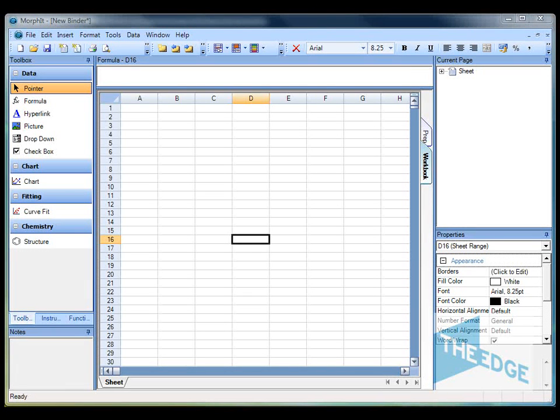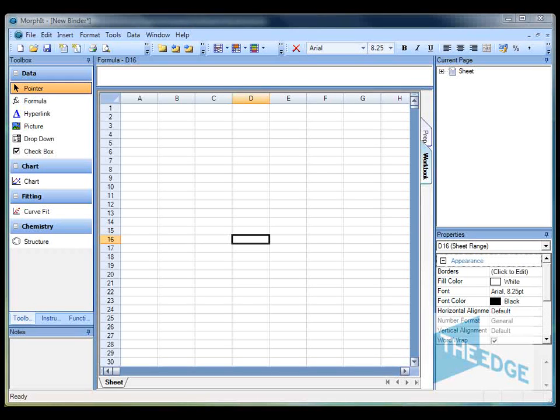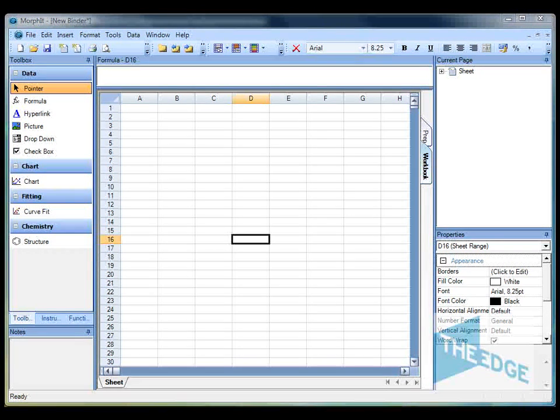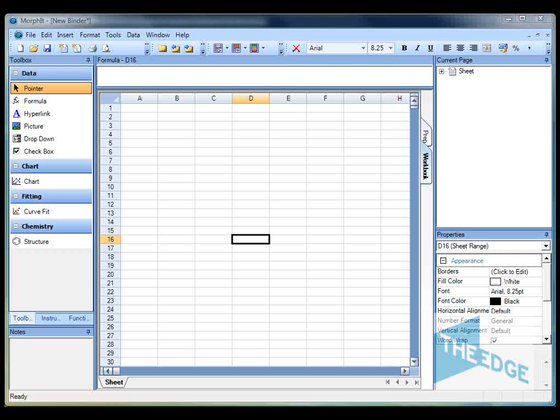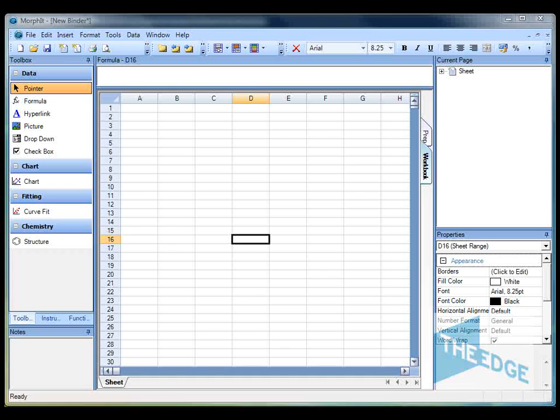Welcome to this Morphit video. My name is Andrew Levin from the Edge Software Consultancy and in today's video we're going to be showing you how to use the Structures for Morphit plugin for visualizing and using chemical information within the Morphit spreadsheet environment.